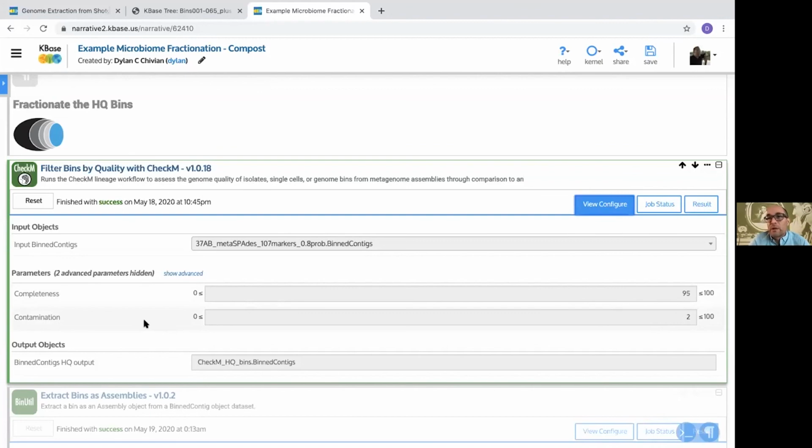That's pretty low, and the fact is a lot of the definition of completeness and contamination is based on pangenome analyses of isolate genomes sequenced to date. That's only a portion of what's out there. And so our picture is improving rapidly, but there's still less well-sampled regions of the species tree for isolate genomes in particular, and therefore our ability to get meaningful pangenome analysis is limited.